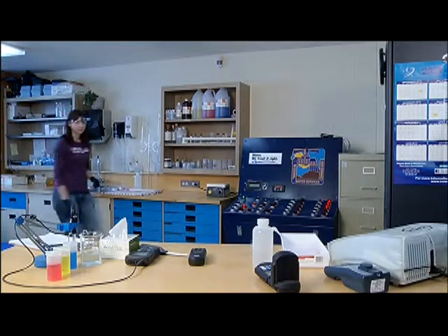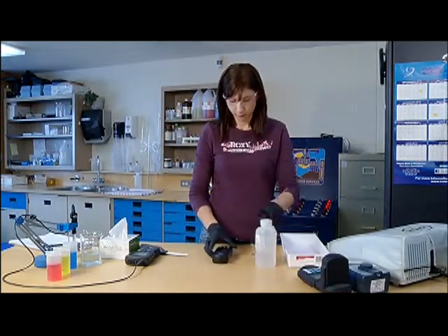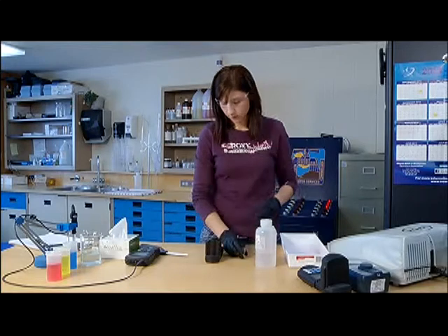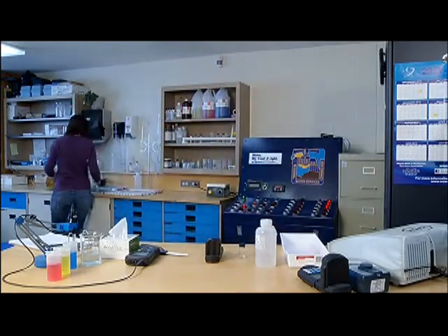While water is flushed through the sample tap, you can use this time to prepare the tools and supplies you'll need to conduct the test. This includes the testing instrument, any rinsing water, reagents, and documents you'll need to follow the prescribed procedure and record the test results.